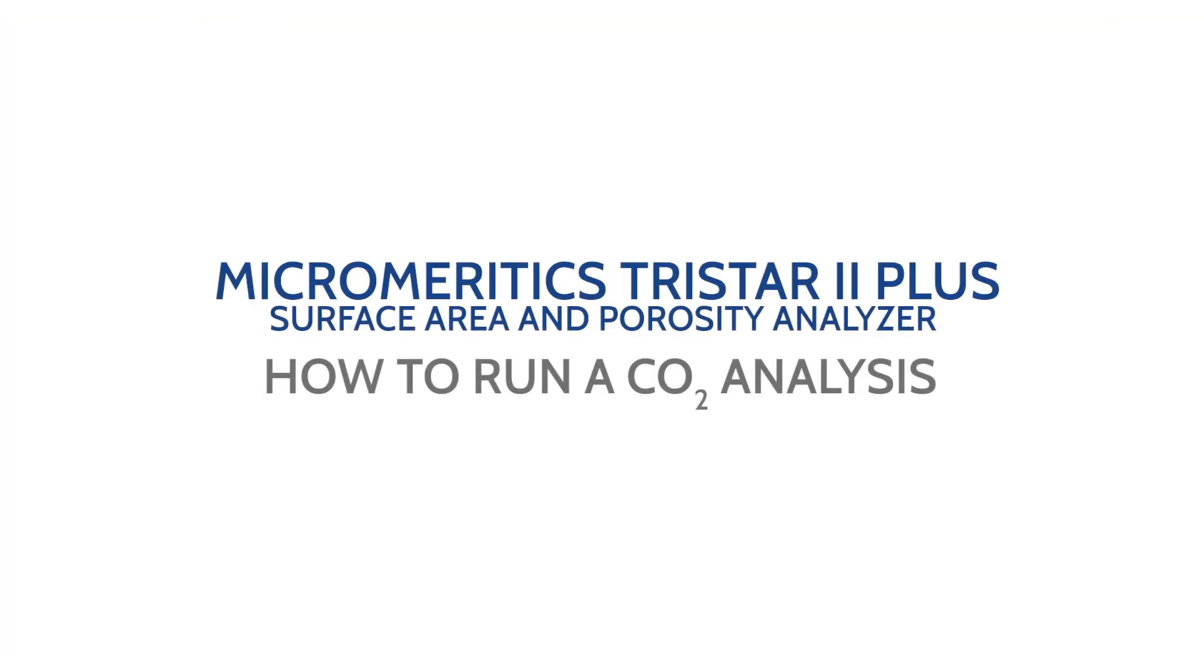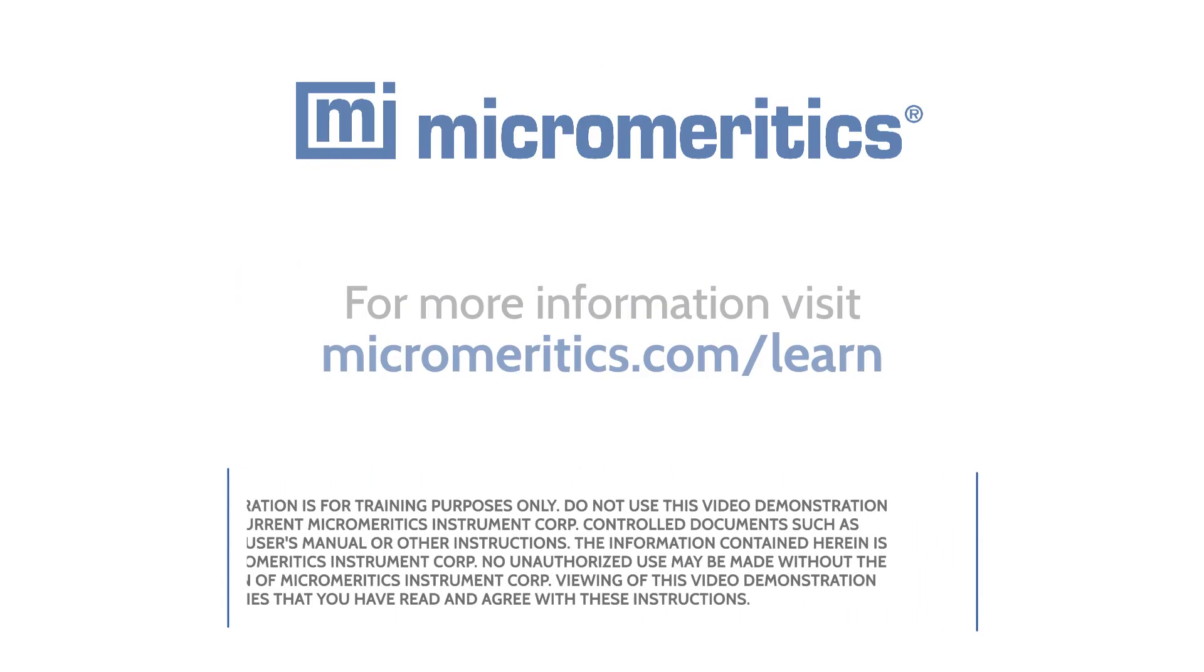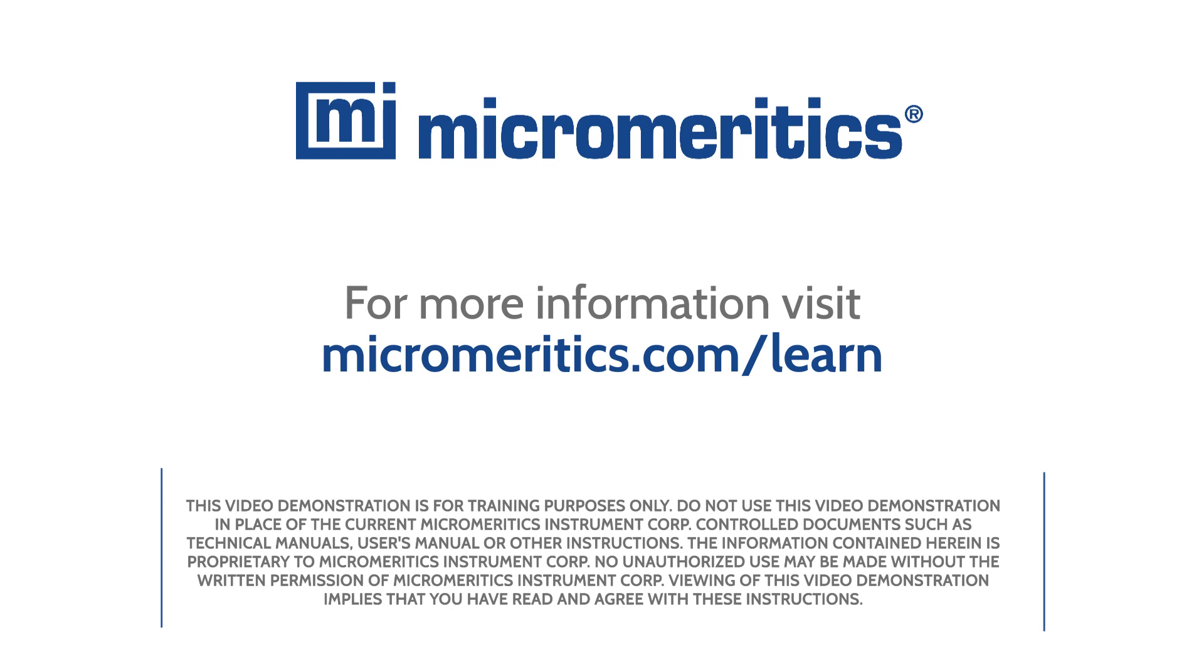Now you are ready to perform a CO2 physisorption analysis on the Micromeridics TriStar 2 Plus Surface Area and Porosity Analyzer. For more information, visit micromeridics.com/learn.